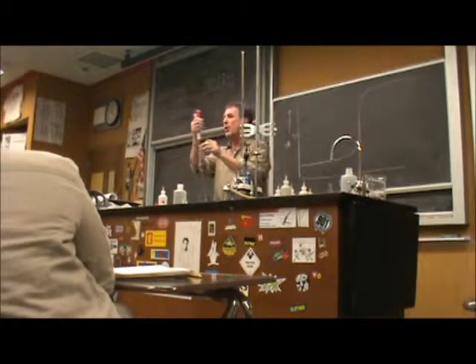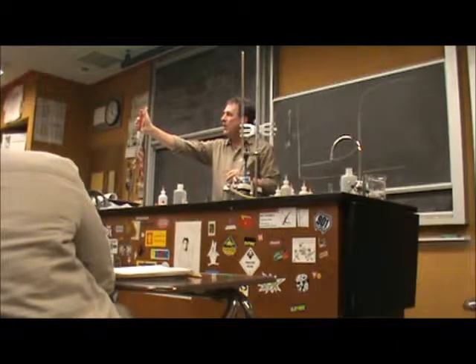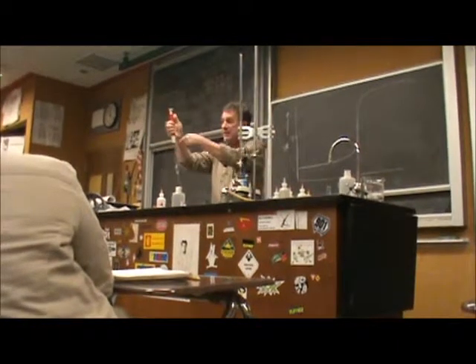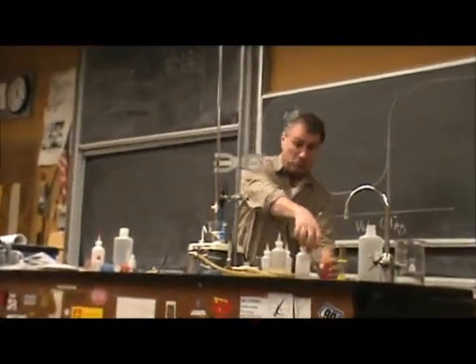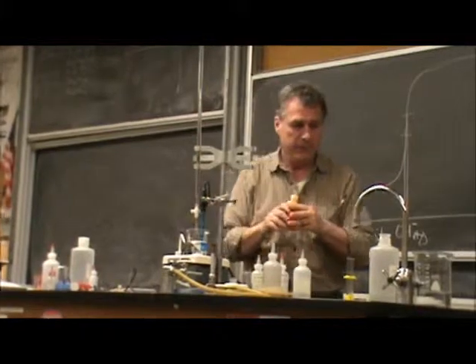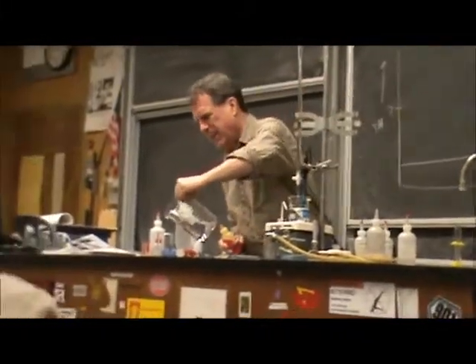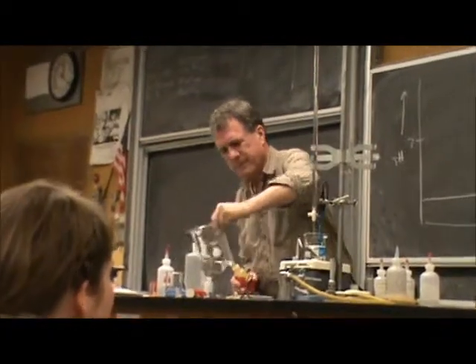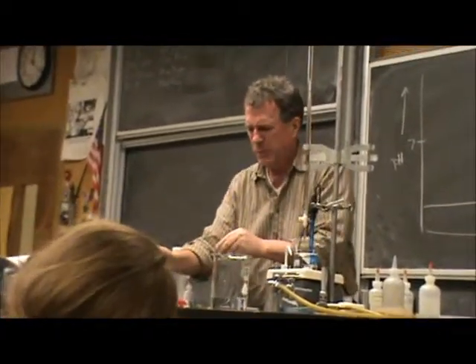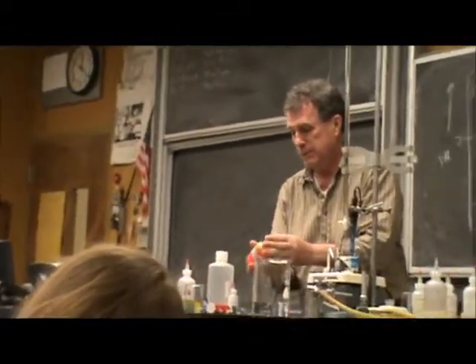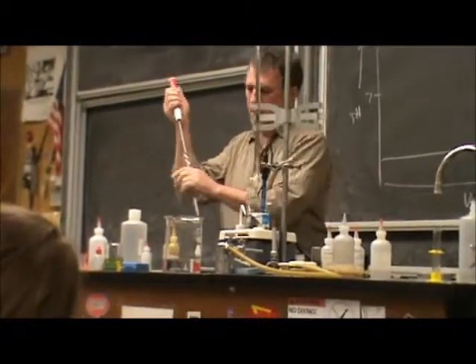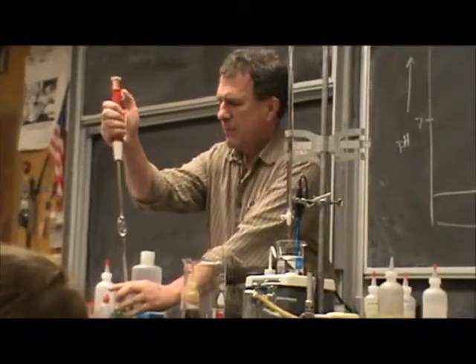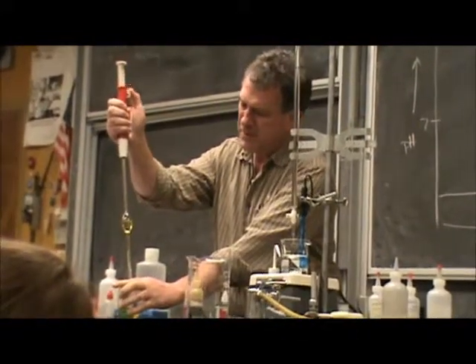So we have a pipette loader. It has a piston inside, a thumb wheel. When I rotate the thumb wheel, it raises a piston inside and will draw a solution in. I will get a colored solution that I can draw in so that you can see it in the pipette.